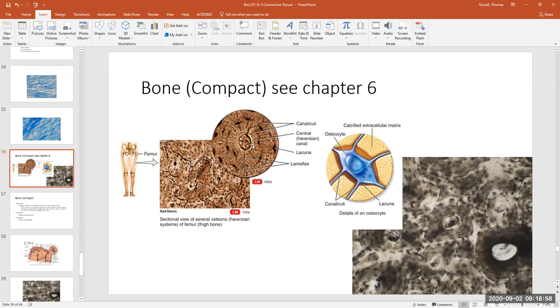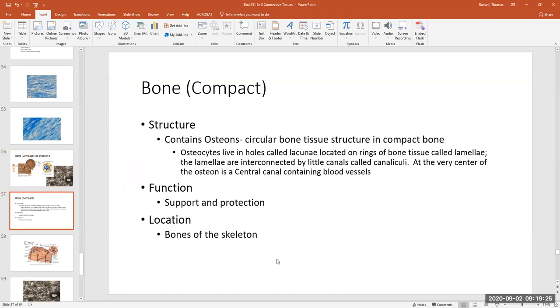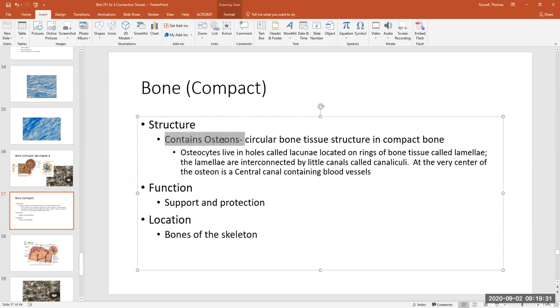Those little circular structures are called osteons. Compact bone contains osteons. Spongy bone does not contain a true osteon. Osteocytes live in the lacunae; the lacunae are found on the lamellae. The lamellae are all interconnected by little bitty canals called canaliculi.